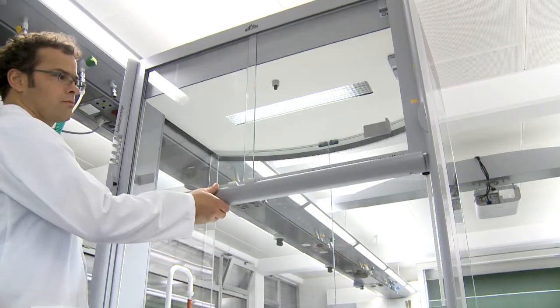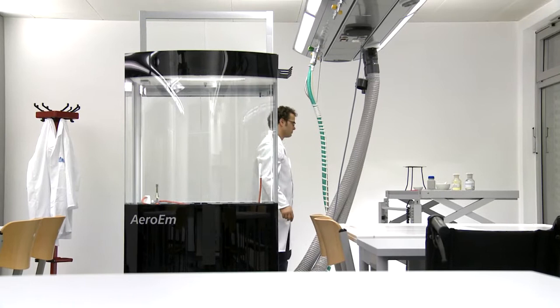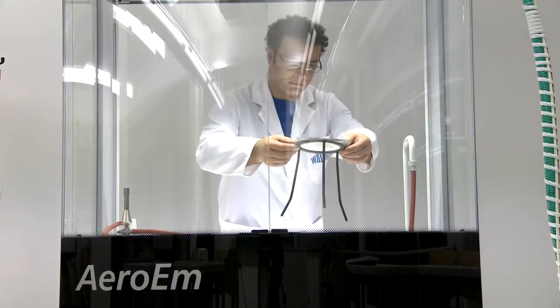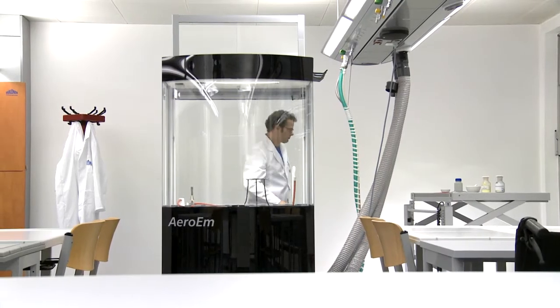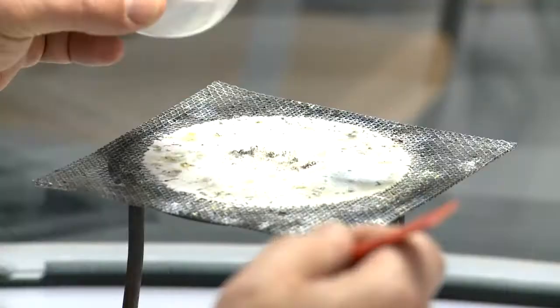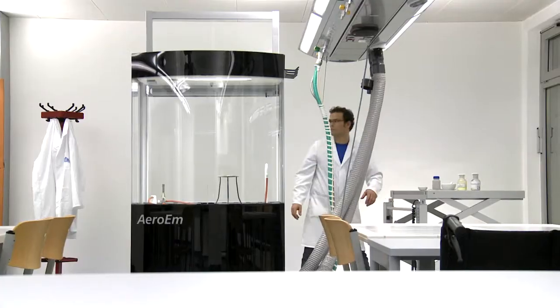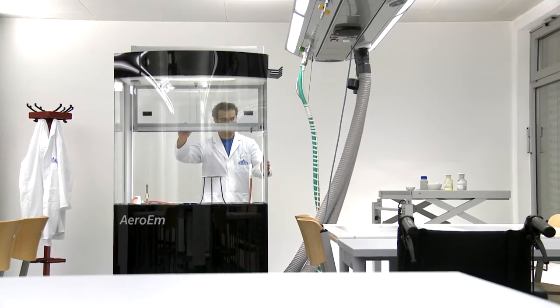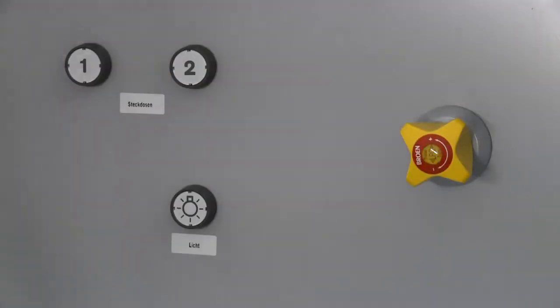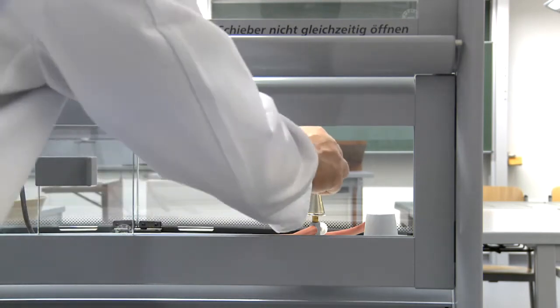The Aero EM has a completely transparent upper part made from safety glass, allowing its working space to be observed without restrictions from all directions. The impact panels made from safety glass are double walled and can be opened inwards for cleaning. The additional sliding panels guarantee head and body protection.